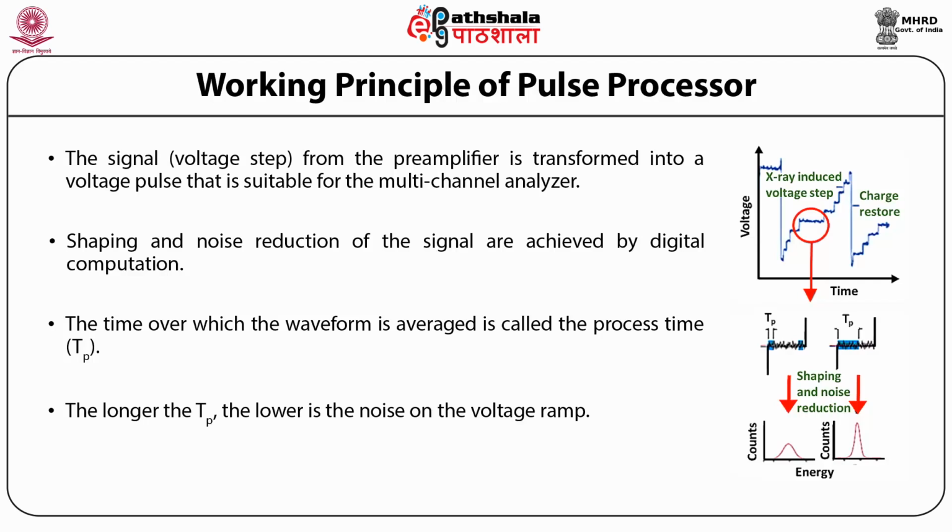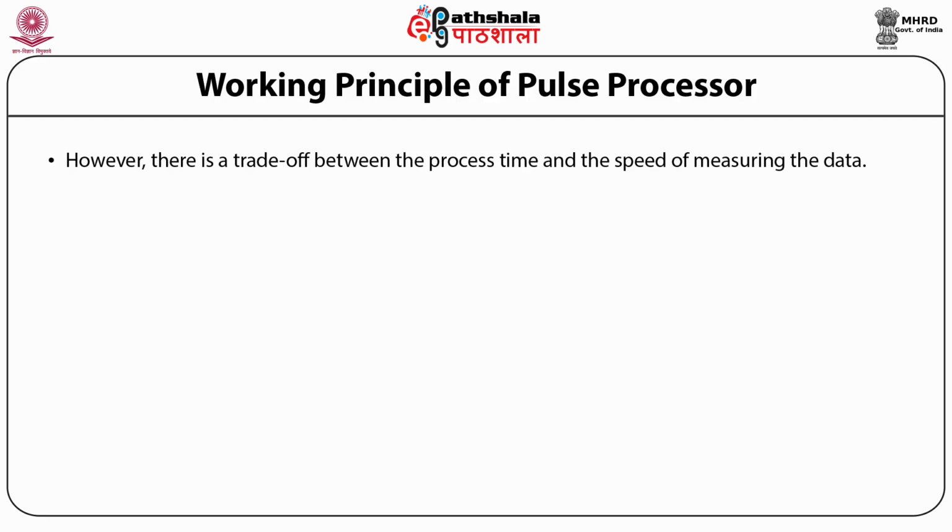If noise is minimized, the resolution of the peak in the spectrum improves and it can be easily separated or resolved from another peak that is close in energy.